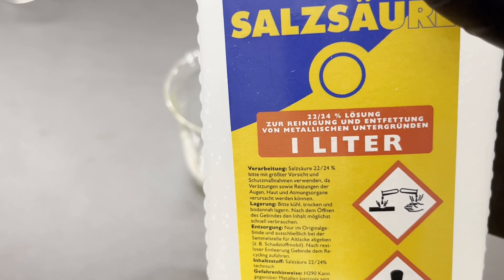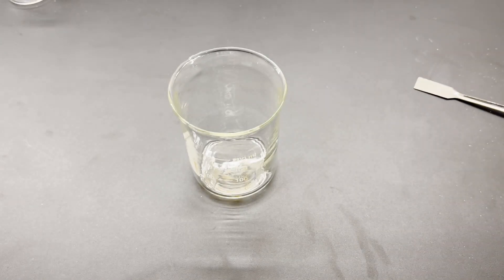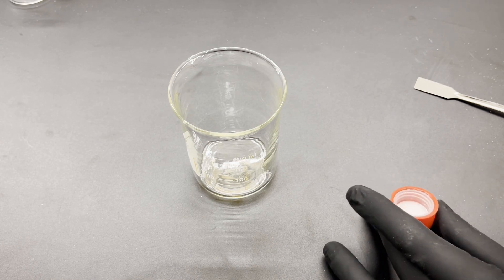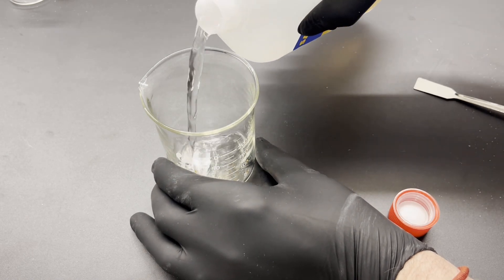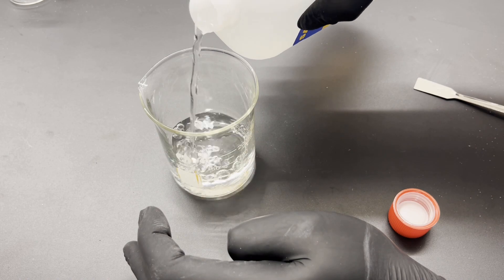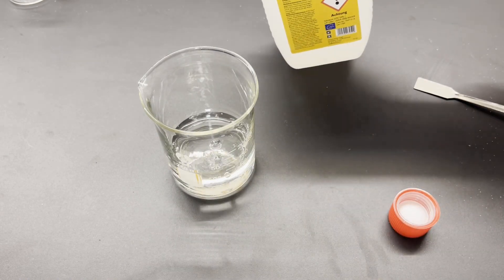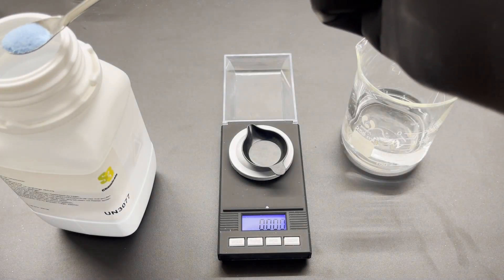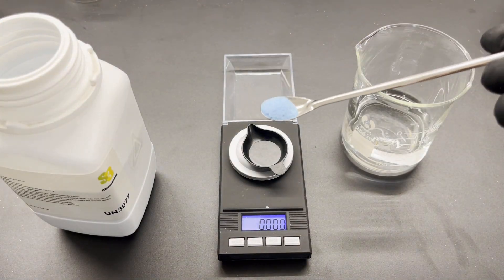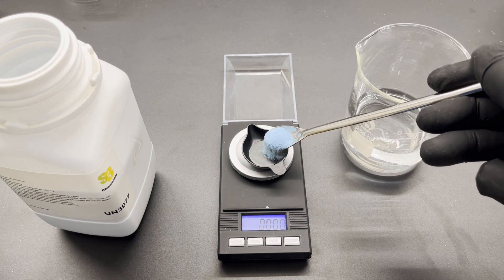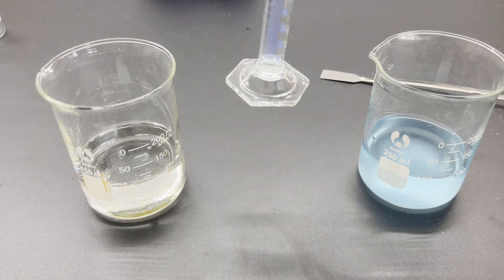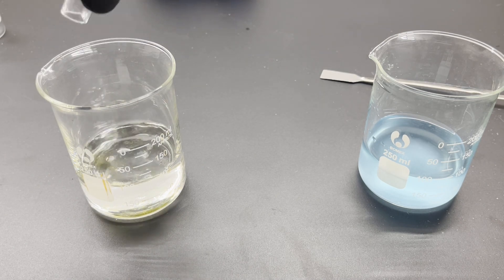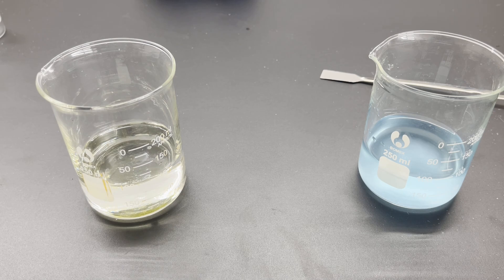In the meantime, 100 ml of 22-24% hydrochloric acid are added to another beaker. In the next step, 1.25 g of copper sulfate pentahydrate is dissolved in 100 ml of distilled water. 0.5 ml of the copper sulfate solution is added to the previously measured 100 ml of hydrochloric acid.